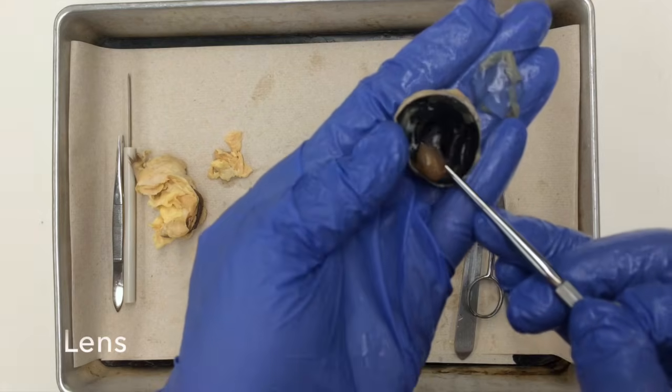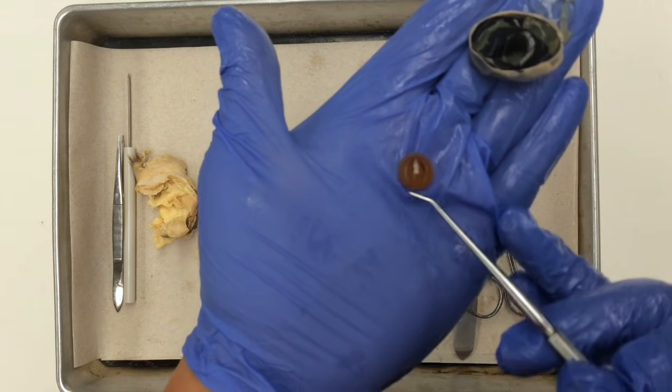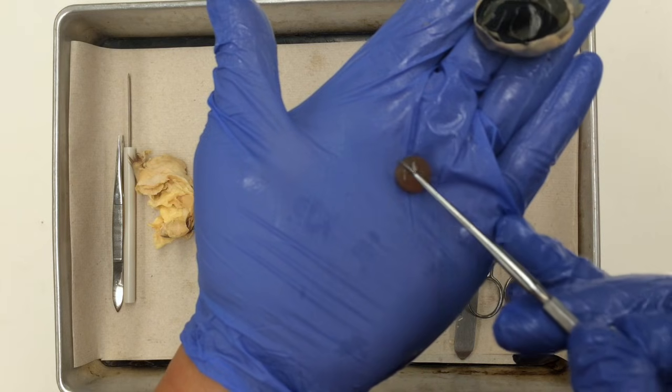I'm going to go ahead and remove the lens. Here's the lens. Under normal conditions, the lens should be translucent, but since it's been sitting in solution, it is slightly opaque, and it is now rubbery and hard.